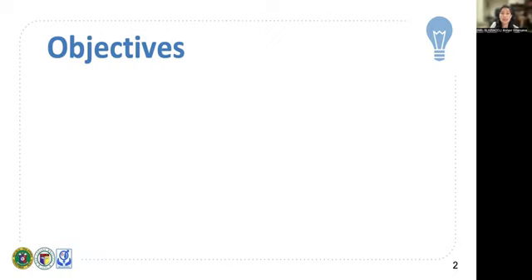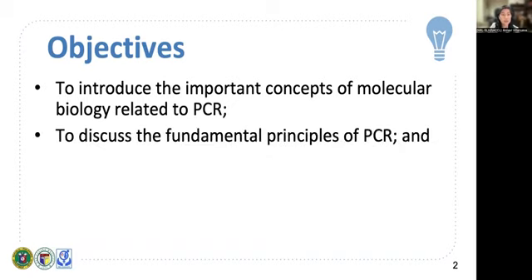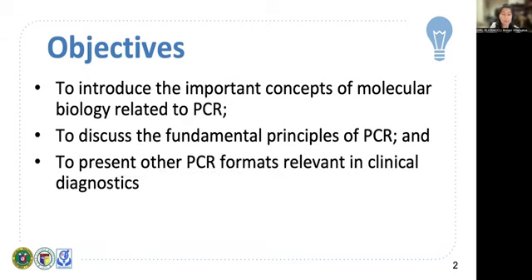Okay, before we begin, I want to present to you the objectives for this lecture. First is to introduce the important concepts of molecular biology related to PCR. Second is to discuss the fundamental principles of PCR. And third and lastly is to present other PCR formats that are relevant in clinical diagnostic settings.